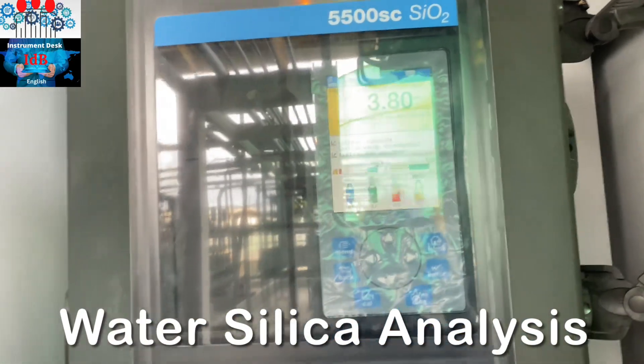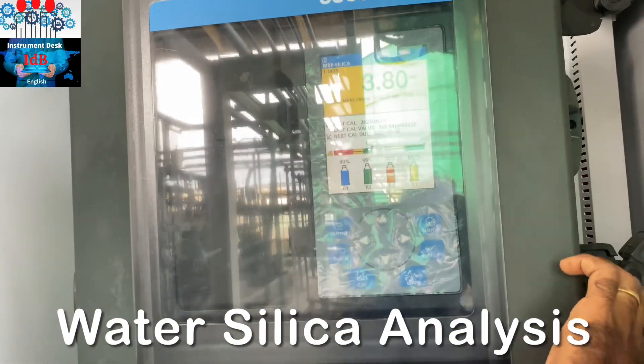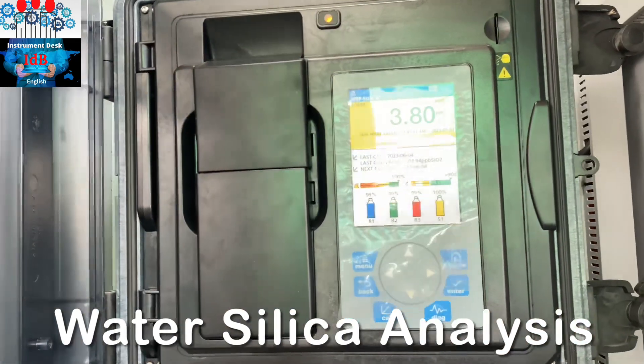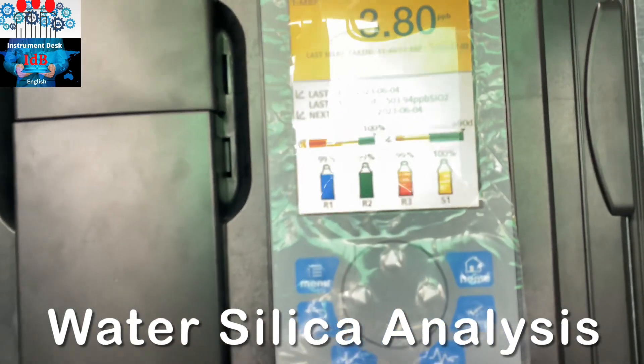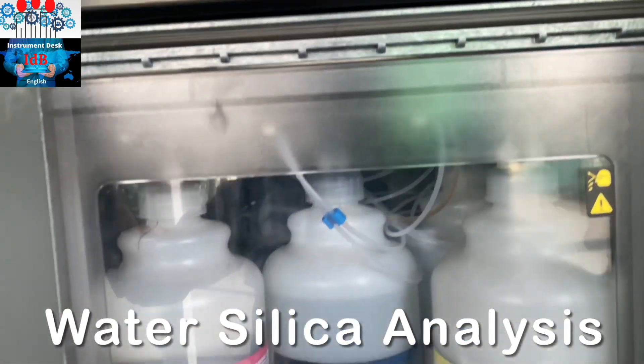This is a silica analyser, so we can open it. This is the reagent level — these are the reagents.